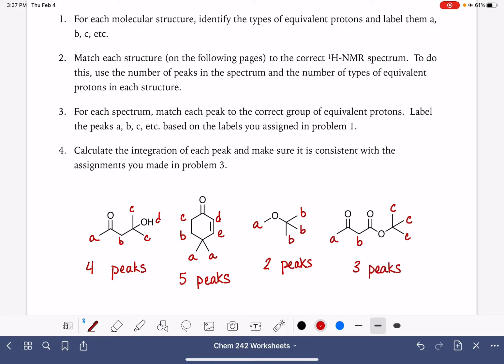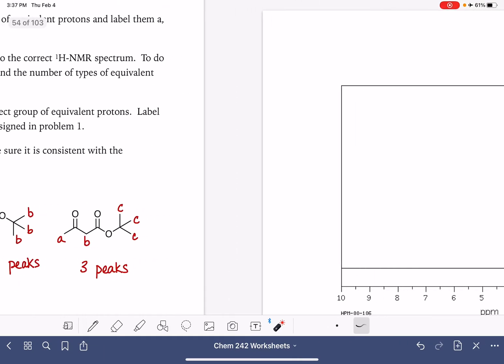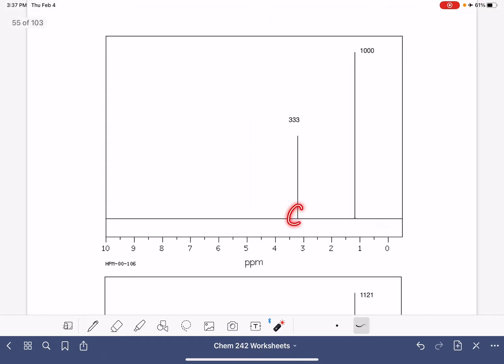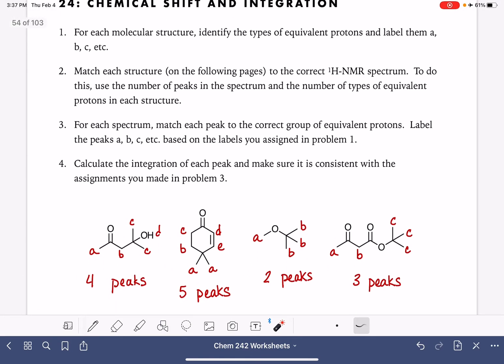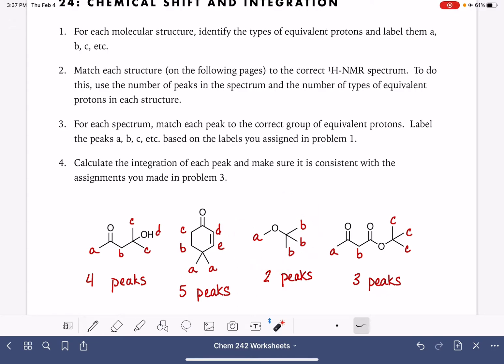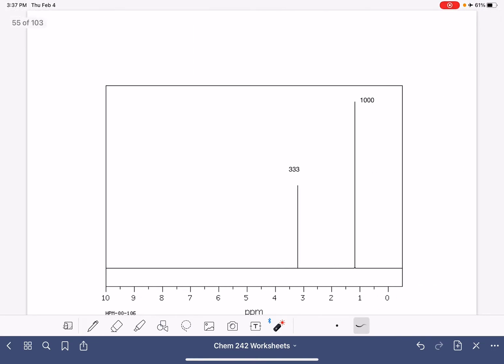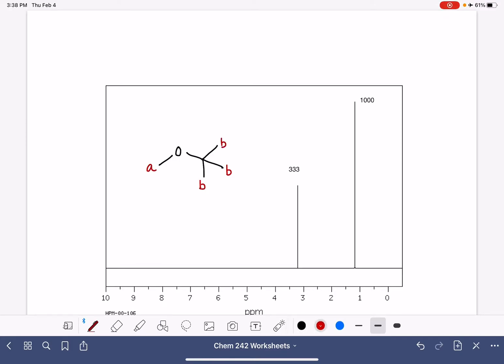Since each molecule has a different number of types of equivalent protons, it has a different number of peaks, and we'll be able to match the molecules to the NMR spectra simply by looking at the number of peaks in each spectrum. Our first spectrum has two peaks in the NMR, and the molecule with two types of protons is this one. I'm going to redraw the structure on the spectrum and assign each type of proton to the two peaks.